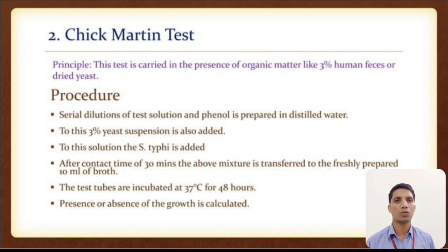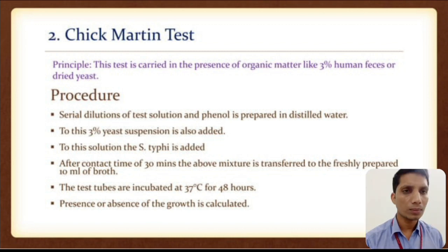Then these test tubes are incubated at room temperature or 37 degrees Celsius for a period of 48 hours. Then the presence or absence of growth is determined using various techniques, like inoculation or microscopic methods.